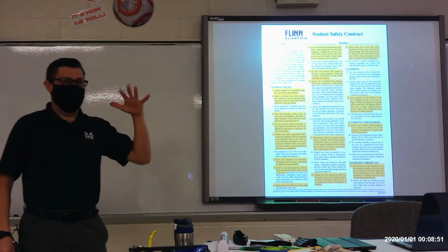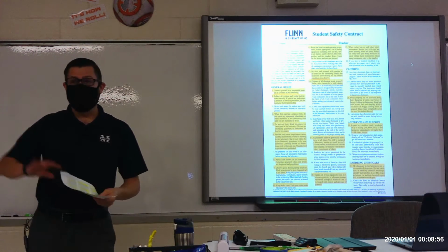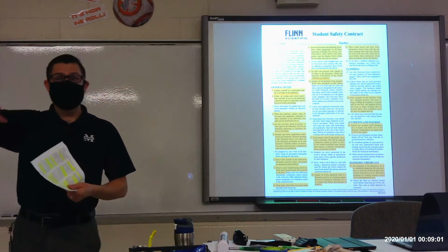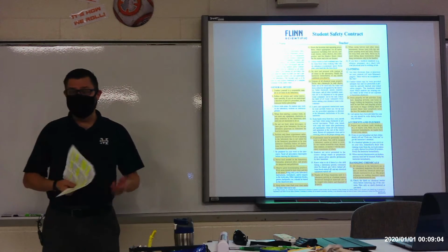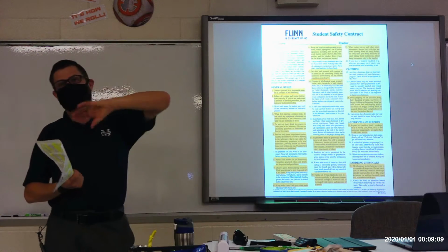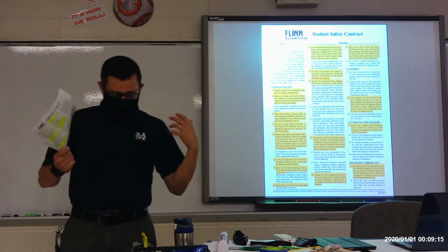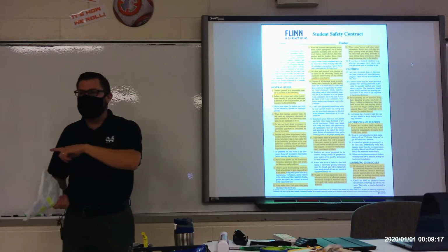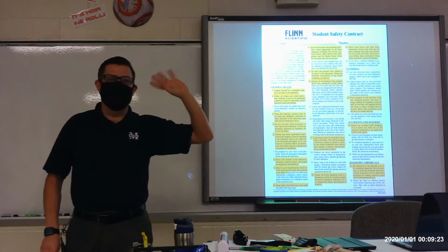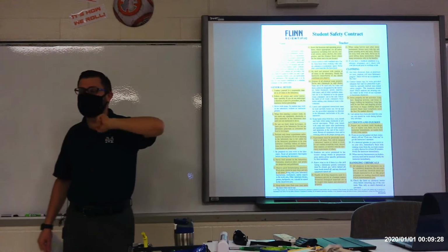And even if we as a class are not doing anything that may be lab related, again, you don't necessarily know what my AP class has been doing, so it's never a good idea to be eating or drinking anything in a lab setting. Now, the only exception that I will make to that is if you have a water bottle, and it needs to be a water bottle that has a seal on it, and if it's like a Yeti cup or something like that, that's fine. You're allowed to have water. Anything else, Gatorade, Powerade, soda, juice from the cafeteria, whatever, I should not see out. If it has a lid and you can seal it shut, put it away in your backpack.